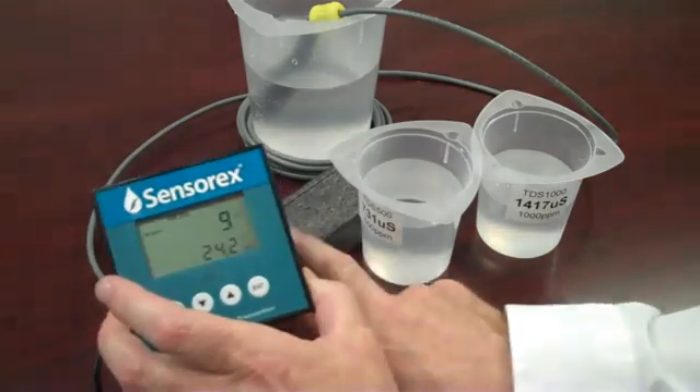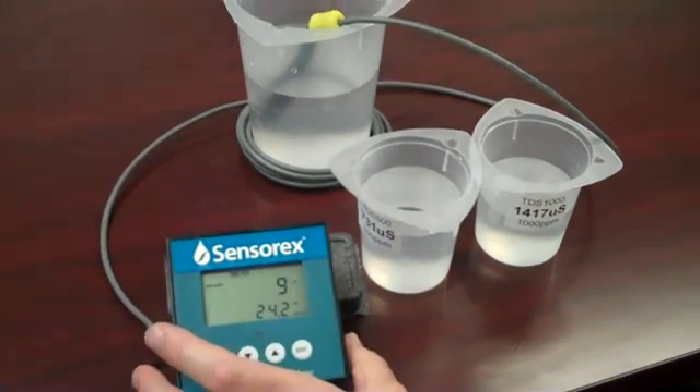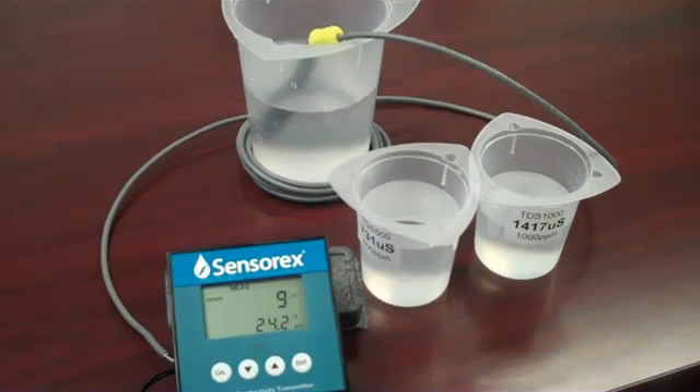Most instruments will require that you select the range of measurement. Use the setup menu as shown in the user instructions.